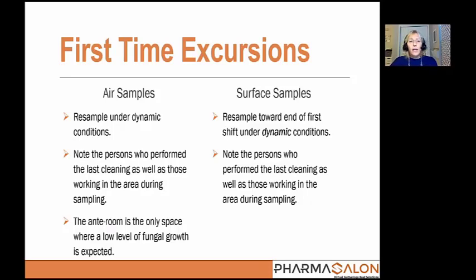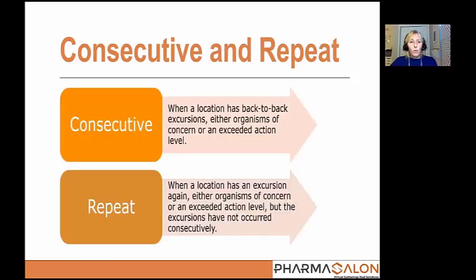Now, as far as looking at what I like to call these consecutive and repeat excursions, we're going to have some different steps that we're going to take here. So this is not in the chapter. This is a way that I like to define these excursions so they make sense and you can figure out what the right next steps are.